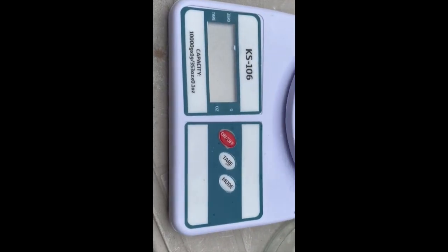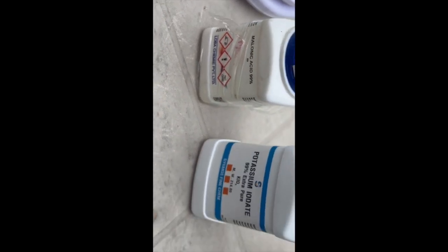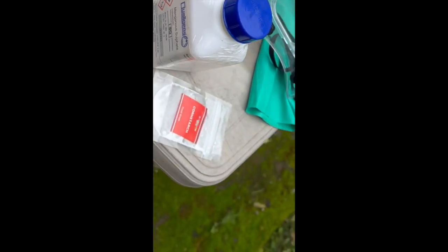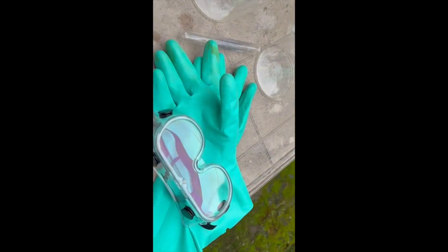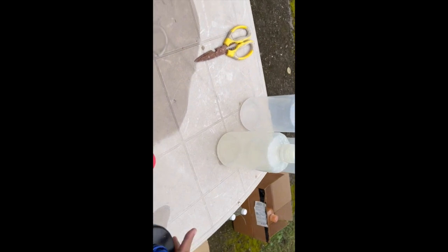The materials required are just the kitchen scale, it does not have to be too accurate, petri dish, malonic acid, potassium iodate, manganese sulphate, corn starch, gloves and goggles. As I previously mentioned, all these glass instruments, they cannot be plastic because sulphuric acid is also involved and it heats things up very quickly. You also require hydrogen peroxide and a bunch of distilled water.